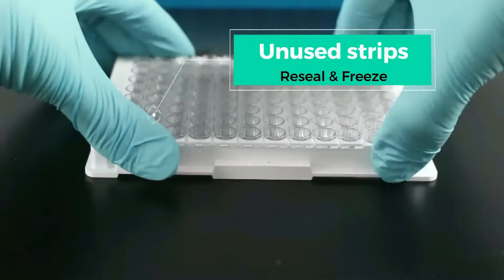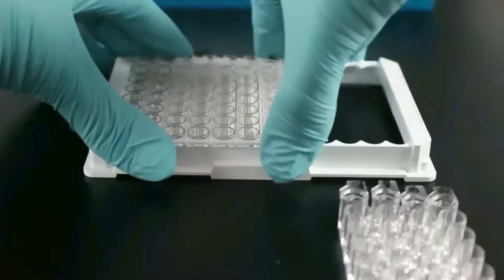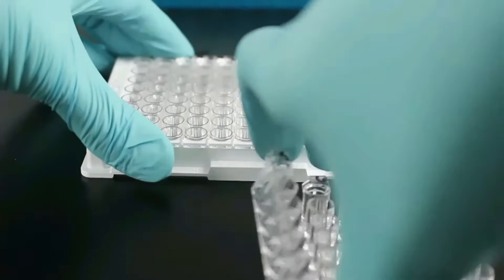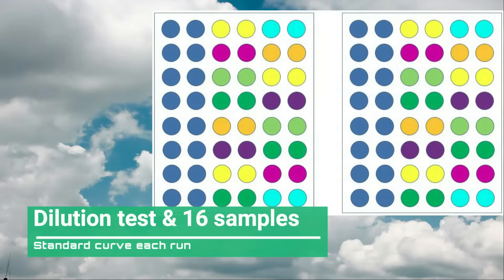If this is your first step, we've got you. Our plates come with removable strips that can be resealed and frozen back. All you have to keep in mind is that each run requires a duplicate standard curve. Our kit comes with enough lyophilized standard for two separate runs. Here are a few run options.